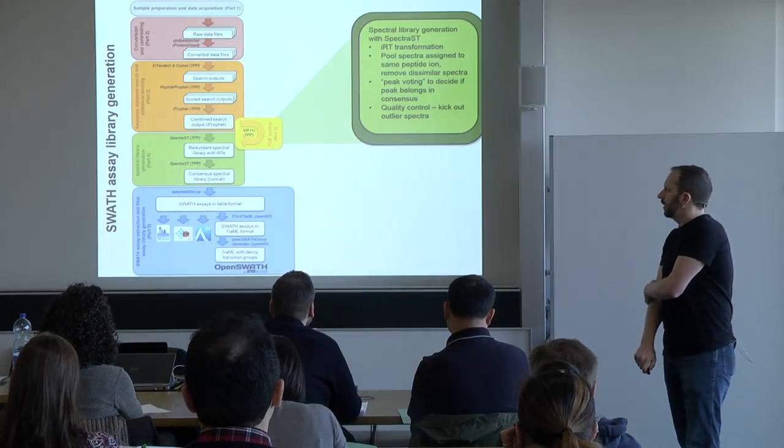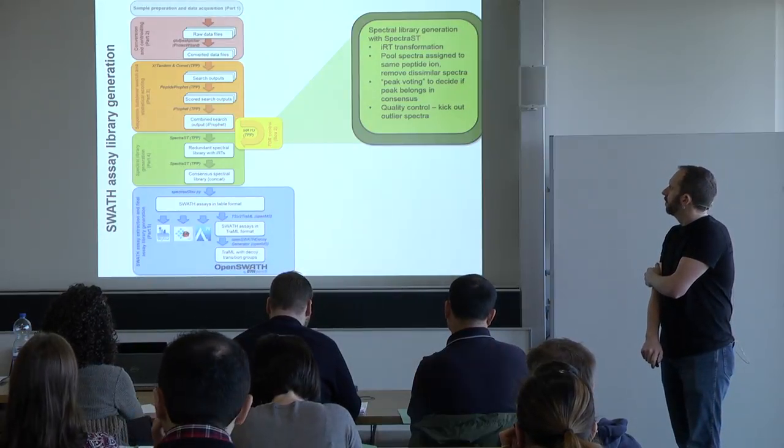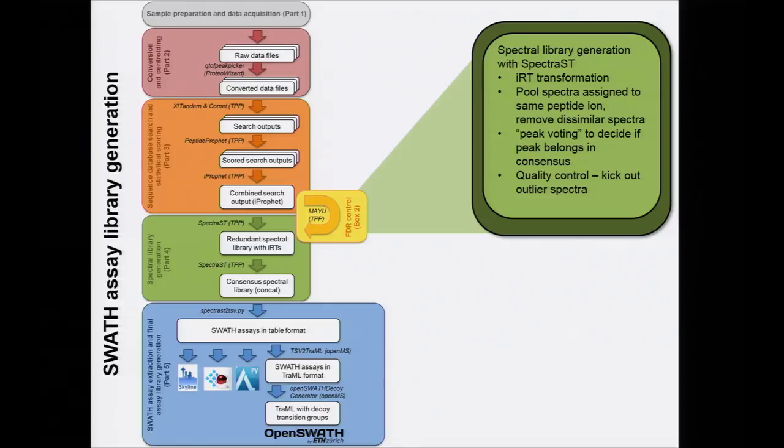Okay, so what about the spectral library? There are several things that are happening in this spectral library part. For one, we're doing transformation into this iRT space, right?